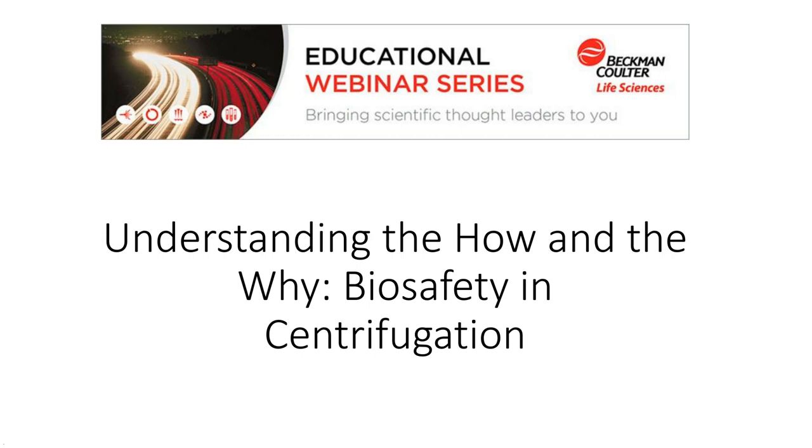Yes, at the back of our rotor catalogs, we have chemical compatibility charts. Certainly, you're welcome to contact me or those in the company who can help you there. O-rings are specific to each rotor. So again, the catalog is the best place to go, to the particular rotor page of interest, and it will contain the O-ring information. Keep in mind also, there are often multiple O-rings with a rotor. So just make sure you are looking at all the O-rings that need to be replaced.